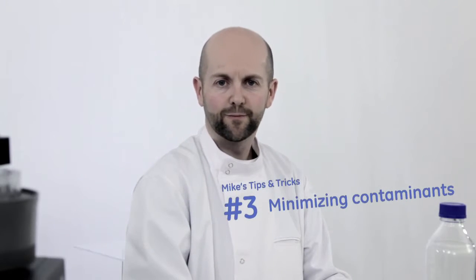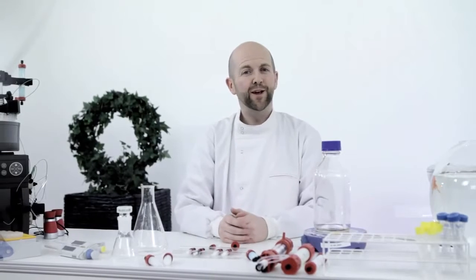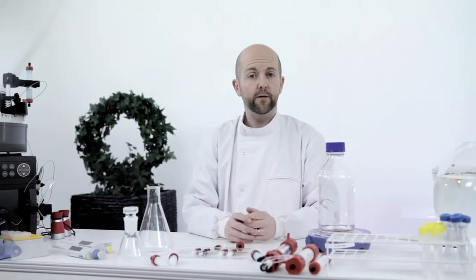Mike's third tip, use the imidazole concentration to minimize contaminants and increase purity. Non-specific binding is one factor influencing purity. A contaminant may bind to the medium or the ligand. This is easy to handle.